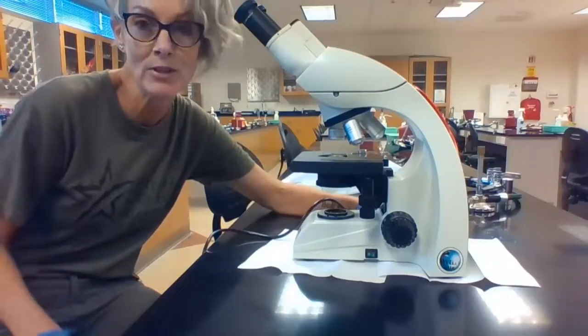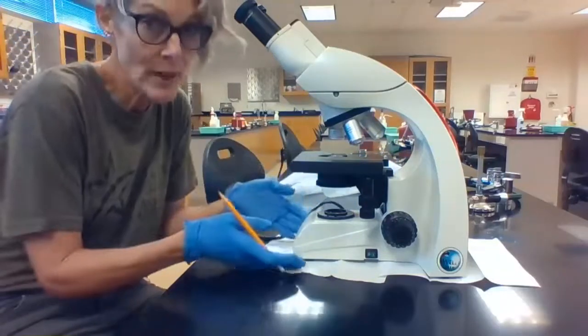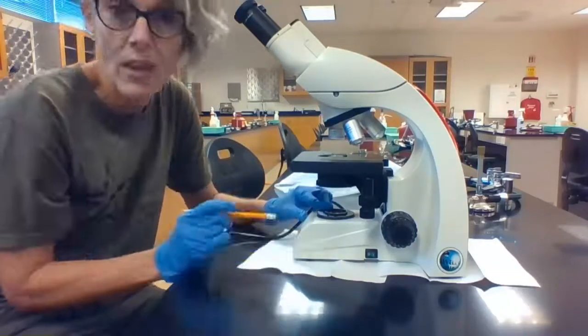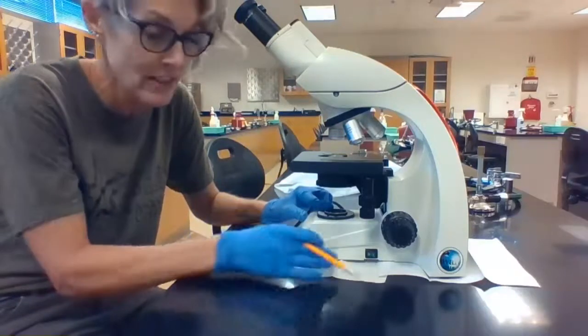Let's review some of the parts of the microscope. We'll start with the bottom and work our way up. The bottom is the base, and this part of the base is called the sub-stage — this is where our light source is. The power for the light source is right here on the right-hand side; it's a green switch. Go ahead and turn that on.